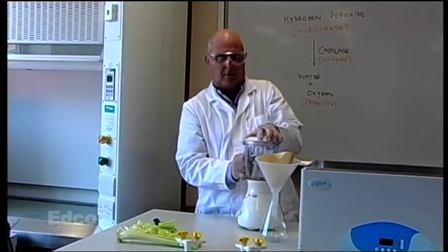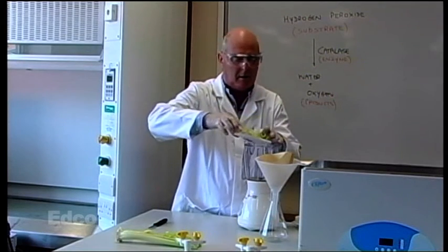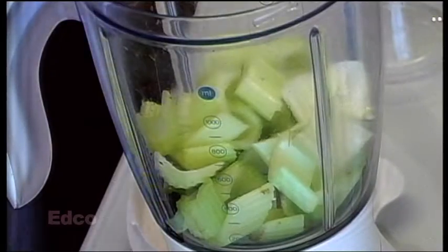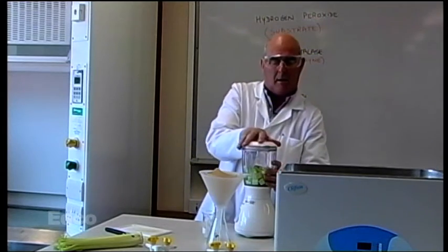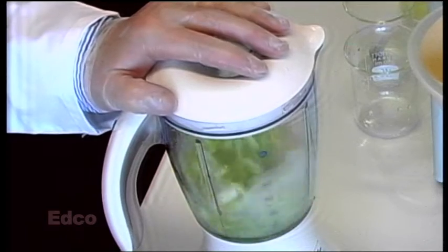And transfer it to a blender. So we add in some water. And we blend it for 4 seconds.